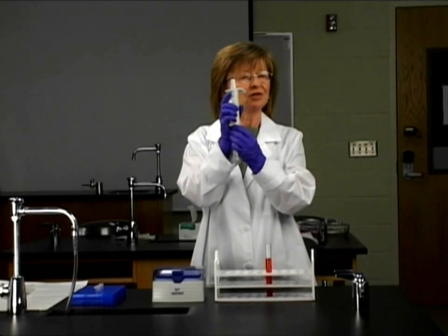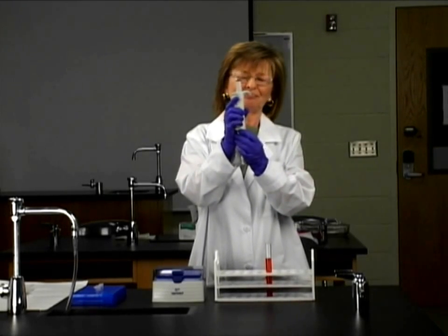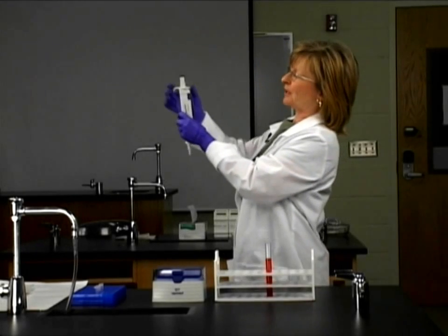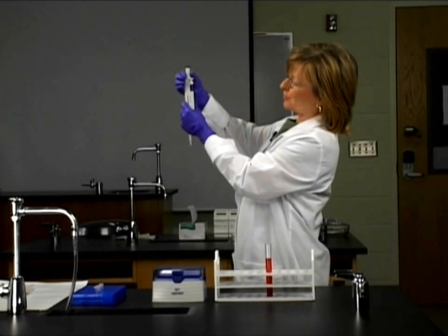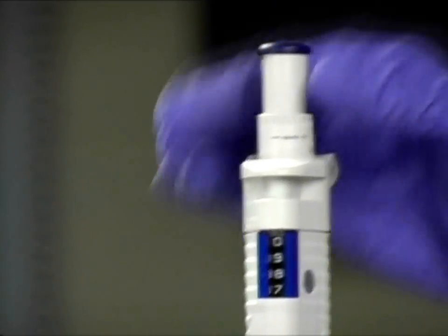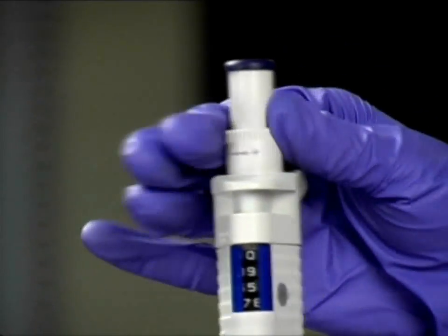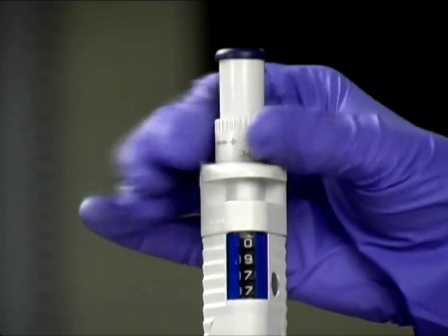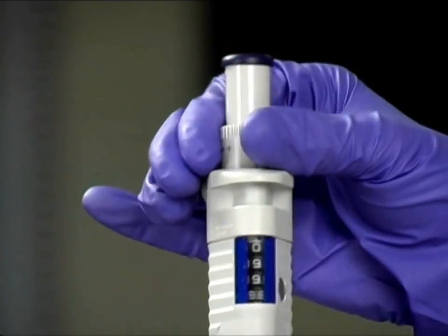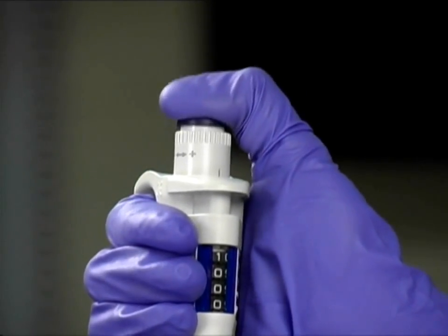This happens to be a 1,000 microliter, or 1 mil micropipet. Of course, we want to be able to change the volumes. These are variable volume micropipets, and you can see from this dial I'm dialing the volume down and this way up. So I'm going to set this at 1,000 microliters.